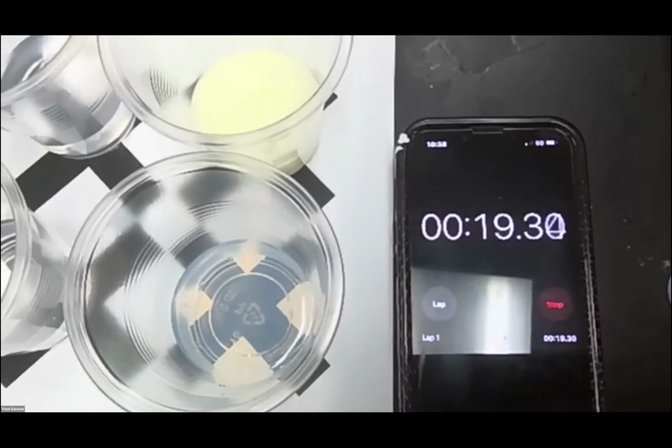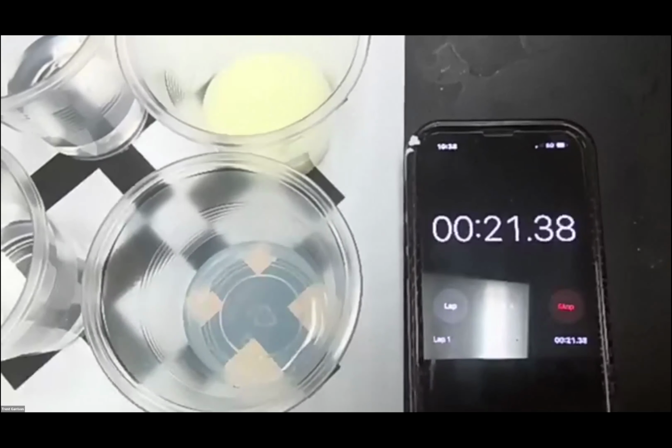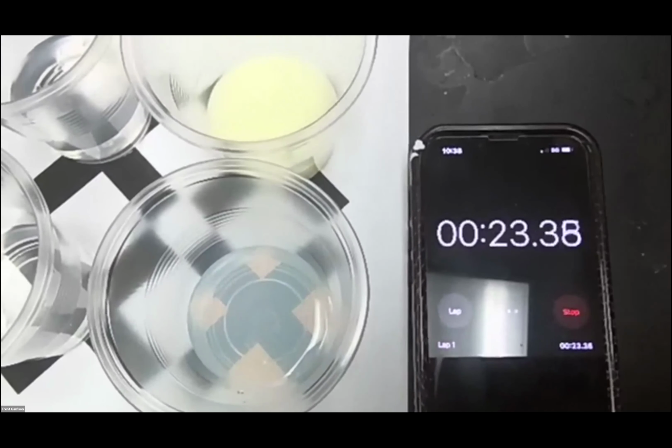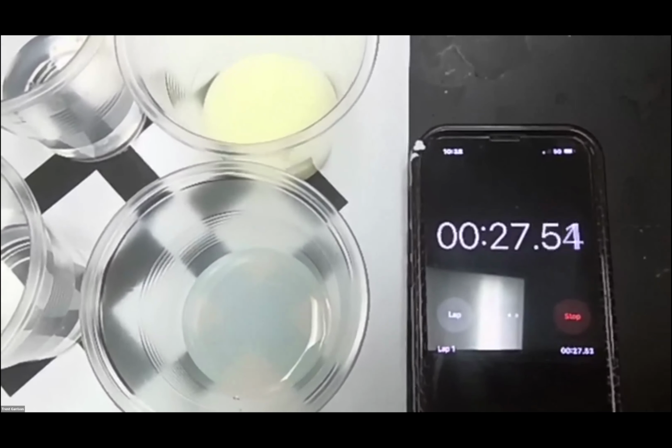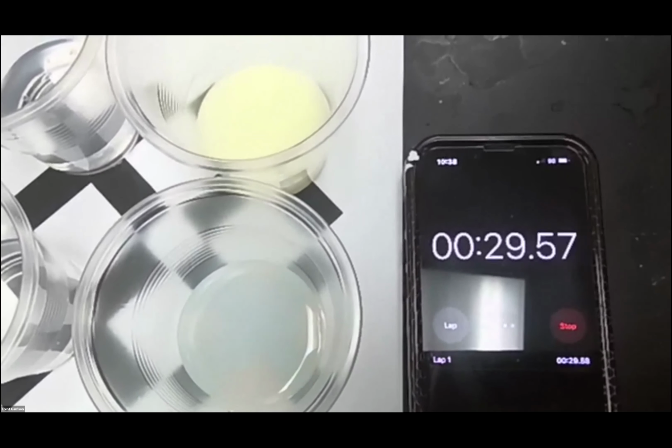So it's starting to obscure it. I could still see the X. I can still see the X. And so I could still see it's a little bit beyond it. So now we're going to stop it right there at 30.